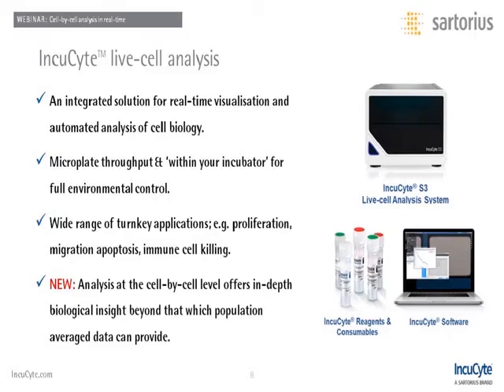There are a wide range of assays for quantifying phenotypic changes, including cell proliferation, apoptosis, and immune cell killing, to name a few. So far, IncuCyte analysis of these assays has been based on population average data, whereby information from all objects or cells in the field of view is consolidated into an aggregate metric. While this type of analysis is a powerful tool, and such measurements can accurately capture a population state and any variation in it, it fails to differentiate a large effect on small subsets in the greater population. Changes in these small subsets are masked by the greater number of cells in the so-called non-reactive populations.